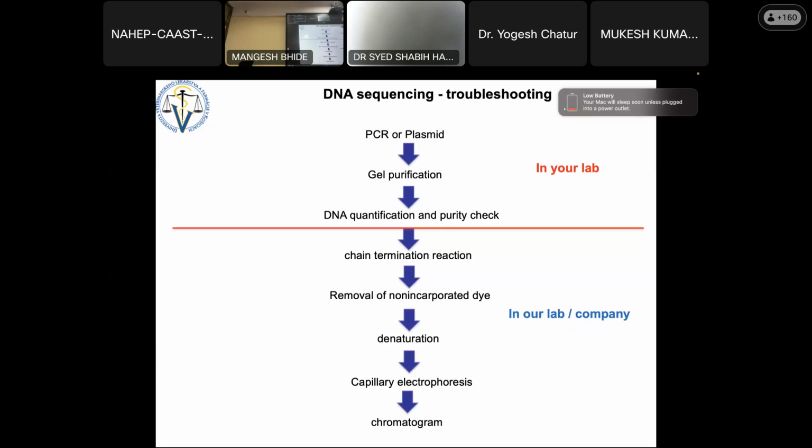What about the chemicals and buffers? We can make them. Yeah, you can prepare your own. Whatever you need for purification. You need agarose. Yeah, agarose is cheaper from ABT company, which is a Spanish company, and ABT is the cheapest agarose and very good. You don't purchase from Qiagen or Bio-Rad. Very difficult. Yeah. And we recycle the agarose. We recycle the agarose. That means.